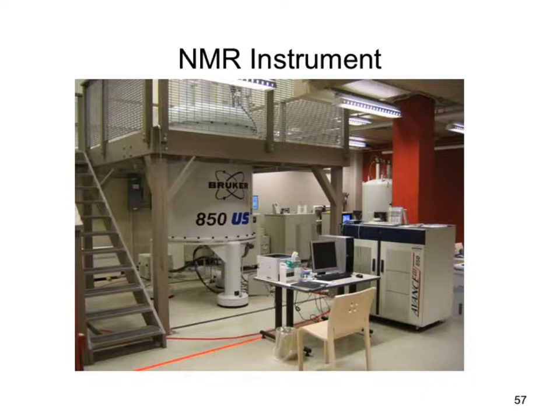Okay? So for those of you wondering why we don't have one here, it's because it's expensive. Okay? And it's not just the instrument. I have to keep that magnet alive. Okay? To get a magnet that strong, what else do I need to do? Electricity is part of it. Any physicists? Cold. Okay. The colder my sample is, the better magnetic field I can get. So I have to get my magnet super cold. Well, why is it not in a refrigerator? Okay.